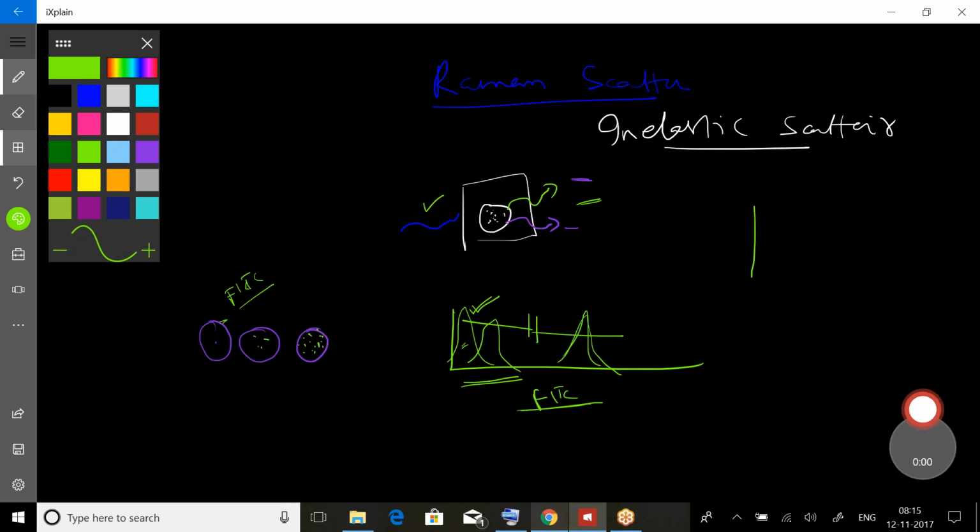So while we are optimizing the instrument, where we are adjusting the voltage, we need to keep in mind that the signal we get from the unstained cell, or the cells not expressing the protein to which we are using the antibody, is what we call autofluorescence. And we adjust it in such a way that we have ample room to see our specific fluorescence. For example, I'm doing a biparametric plot here. So this is where the autofluorescence is. By adjusting the voltage, we assign the autofluorescence level to the cell.